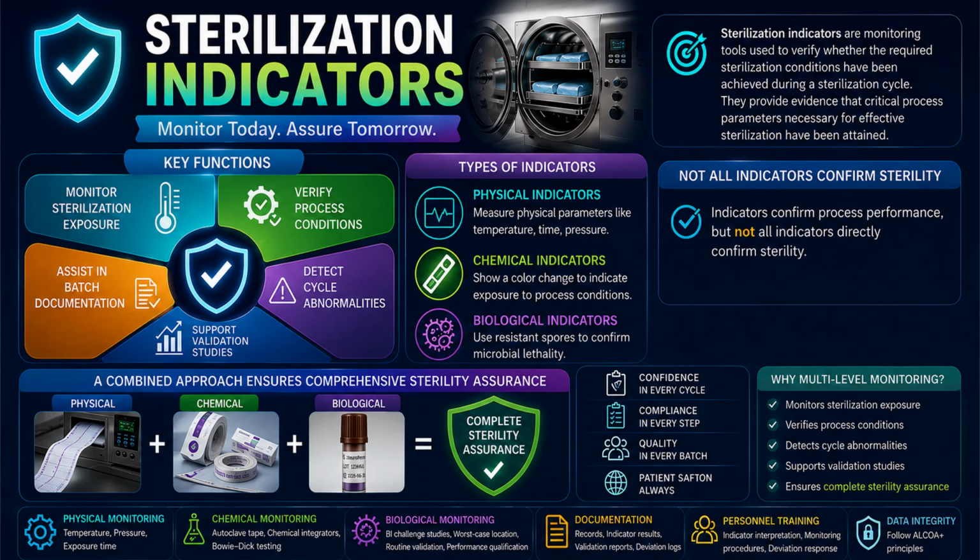Sterilization indicators are monitoring tools used to verify whether the required sterilization conditions have been achieved during a sterilization cycle. They provide evidence that critical process parameters necessary for effective sterilization have been attained.